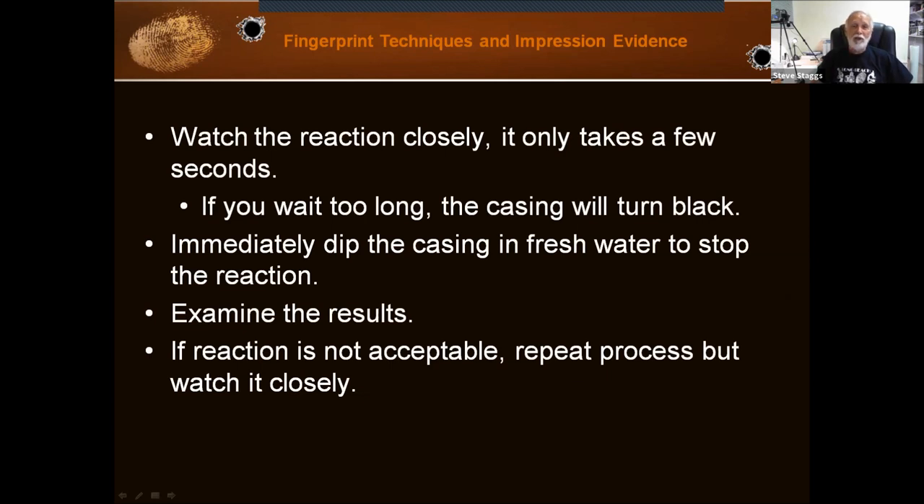If you wait too long, you're going to end up with a black cartridge and you won't see any fingerprint detail at all. Immediately dip the casing in fresh water to stop the reaction. If the reaction is not acceptable, you can repeat the process. Typically I use 50-50 dilution, dip it in for a few seconds, then put it in the water and look. Or you can dip it in the solution and look as you move it toward the water. If it doesn't look like you got enough, go ahead and redo it. The one thing you don't want to do is let it go too long.